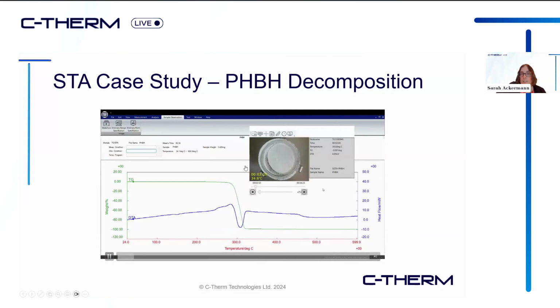So to start with, it's not very eventful, as we would expect, since the material is in its glassy state. We can see that that notch was actually the melt transition of the material. And then we see an exotherm, an endotherm followed by an exotherm followed by an endotherm, which is caused by the depolymerization of the material and combustion. And then, of course, as combustion completes, the DSC plot returns to baseline.